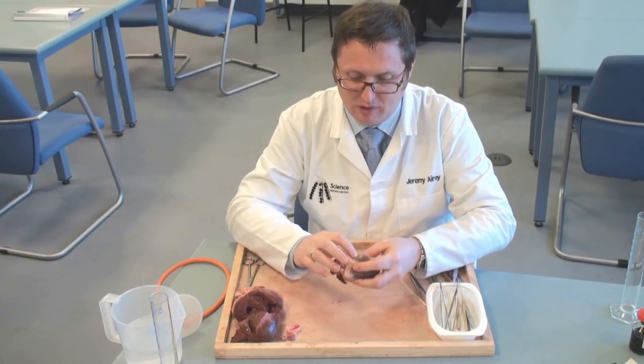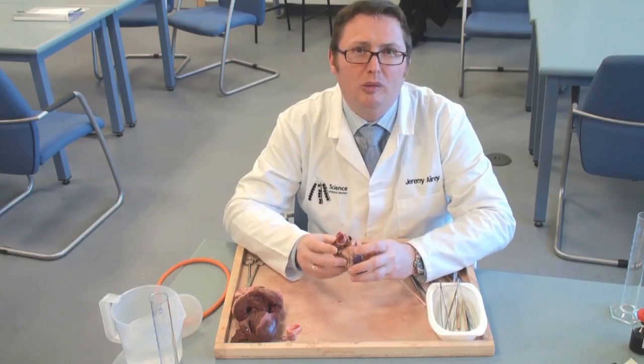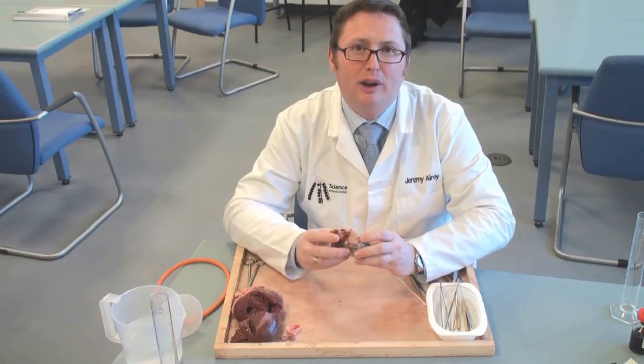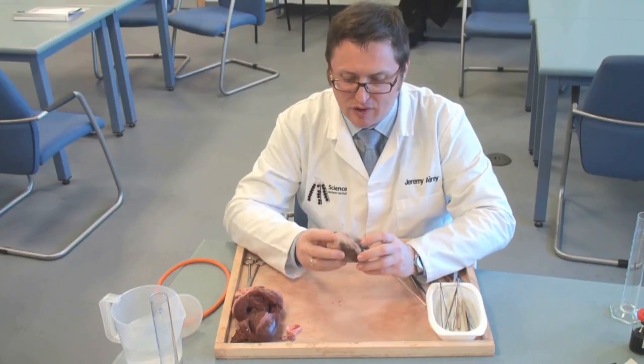This heart's a really nice one — it's only got a tiny little gash in it. I know it can be a problem getting hold of good quality material, and there really isn't any other solution than making friends with the people at your abattoir or your butchers and getting to know them over time.